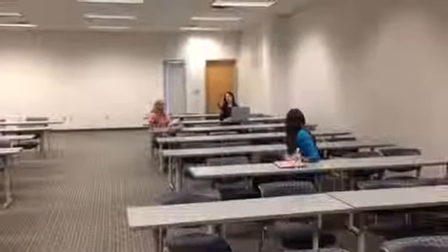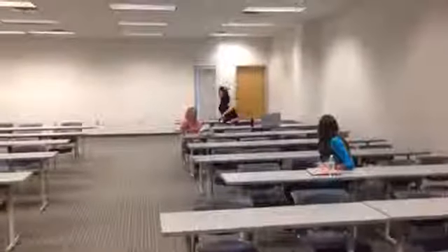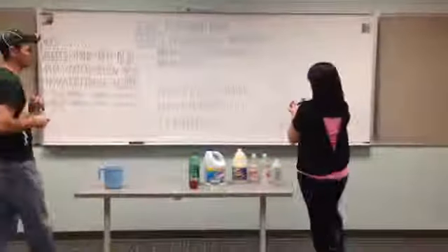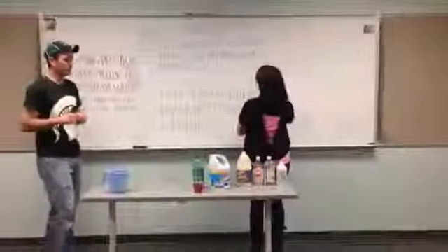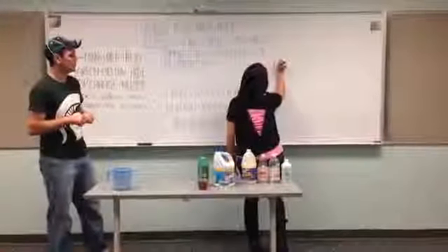I think it's alcohol up there. I think that would be a neutral. Okay, why don't you come up here, write it on the board, and then go ahead and test that out. Okay. Go ahead and write your question on the board. And while you're up there, would you like to repeat your question for the class? Yeah, I'm going to go off of theirs, but I'm going to say, how does alcohol affect the indicator?